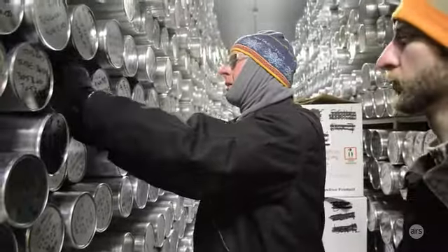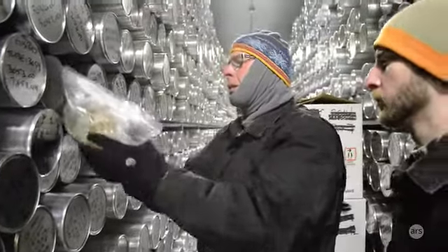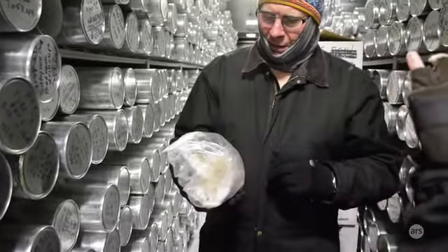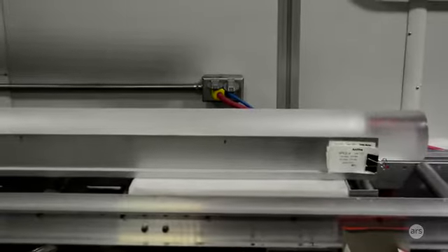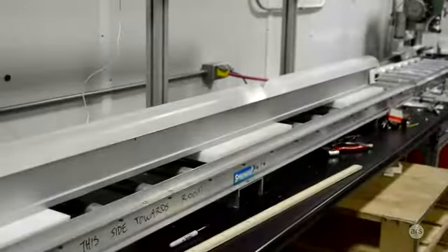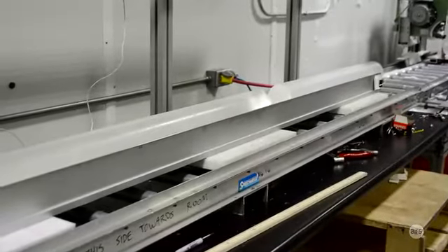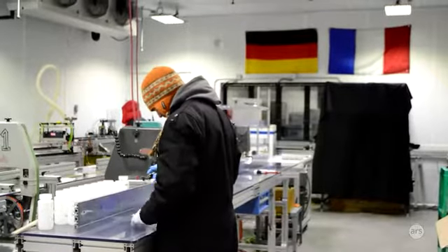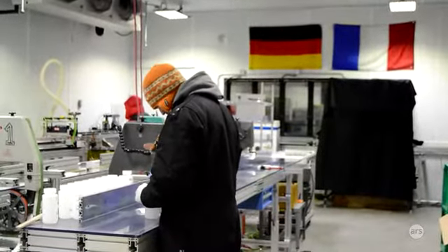When we're looking at the multi-track, so we're looking at the stratigraphy of the core, there we're trying to identify any kind of horizontal irregularities. So we can understand if we're seeing each individual year of snow being deposited all the way back for a continuous climate record, or if there may be small little gaps. While we see irregular layers, none are substantial, but we want to understand that process so that we can learn about where to drill cores in the future.